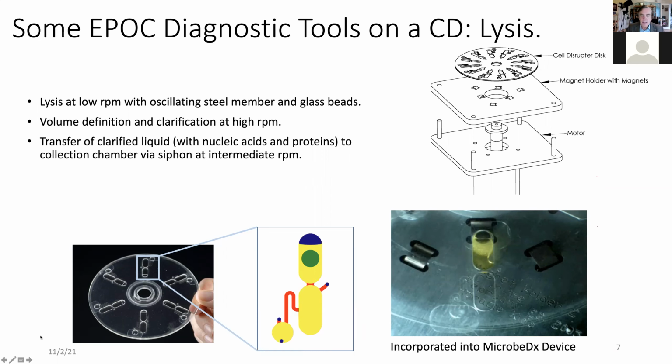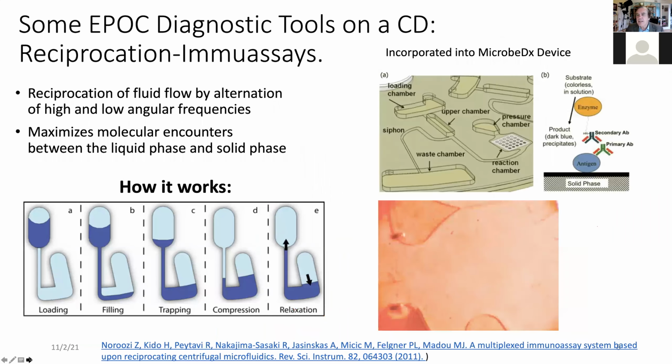Okay, so now the second application, and this very application is the one we will need, because this indeed involves an immunoassay. So you see this paper here that's been put in what we call a reaction chamber. And this could be any kind of antibody or antigen to carry out an immunoassay. Right? And so, for example, in this case, the antigen is at the solid phase, the paper.